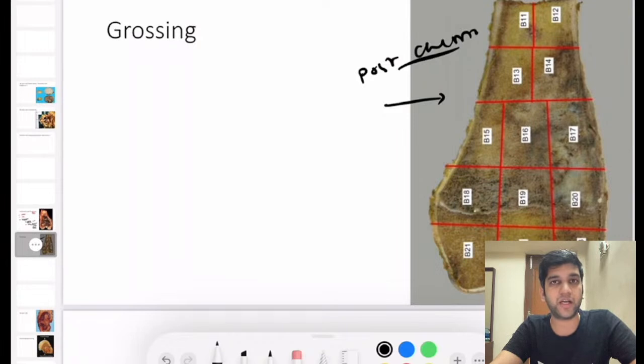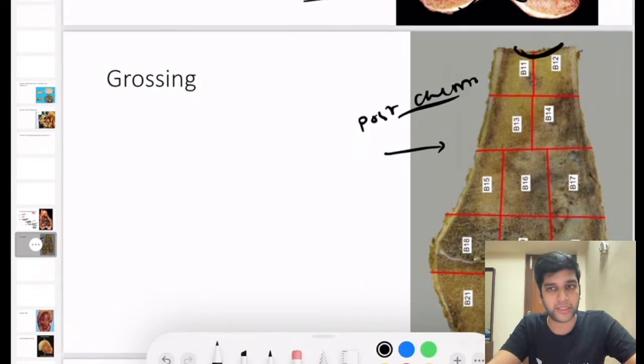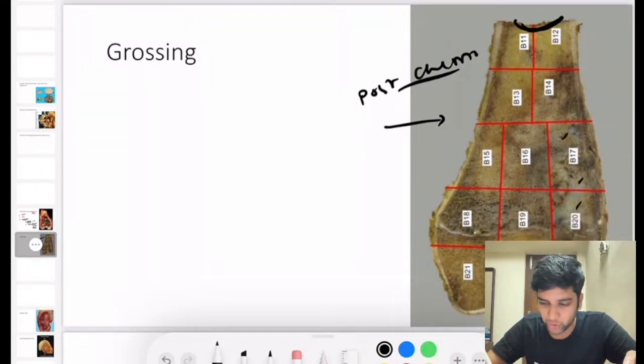Before starting a bone dissection, you will have a bone saw to dissect it. Before doing that, the first and foremost thing is to give the bone marrow. The bone marrow, the medullary cavity, should be given first. If it is not given during frozen section, give it. If it is done during frozen section, I need not give it. If it is not given during frozen, give that first, put in decalcifier, take an entire slice. You can easily appreciate the tumor here, right?